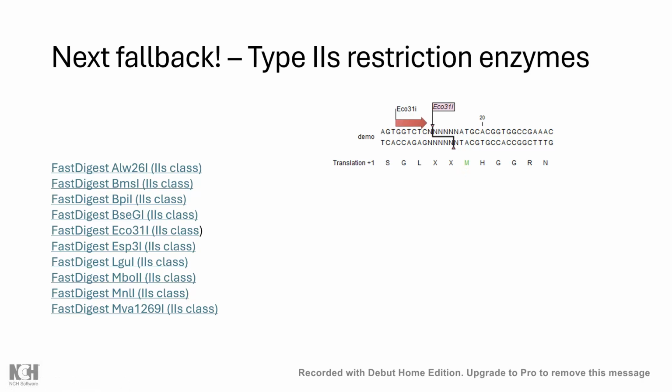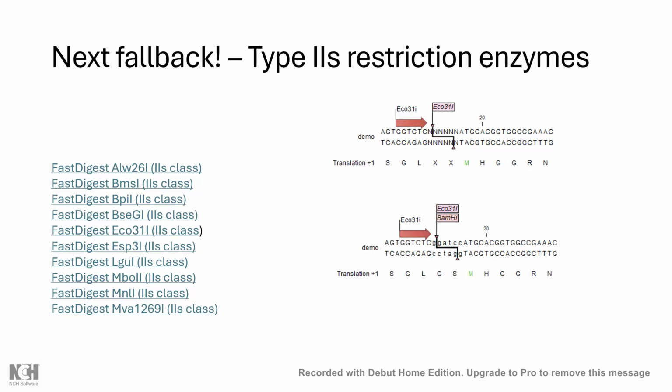And this is where it's going to help you. Because you're already probably thinking, what if there was a BamHI site there? Then here at the end of your PCR product, you have an Eco31I site. When you hit it with the enzyme, it runs on over and promptly cleaves in a BamHI style. So your primer anatomy will look like this: yellow is for your type 2S site, and blue is the site you're creating as a fake. As a result, you have something that will indistinguishably impersonate the cut ends that you're desiring.